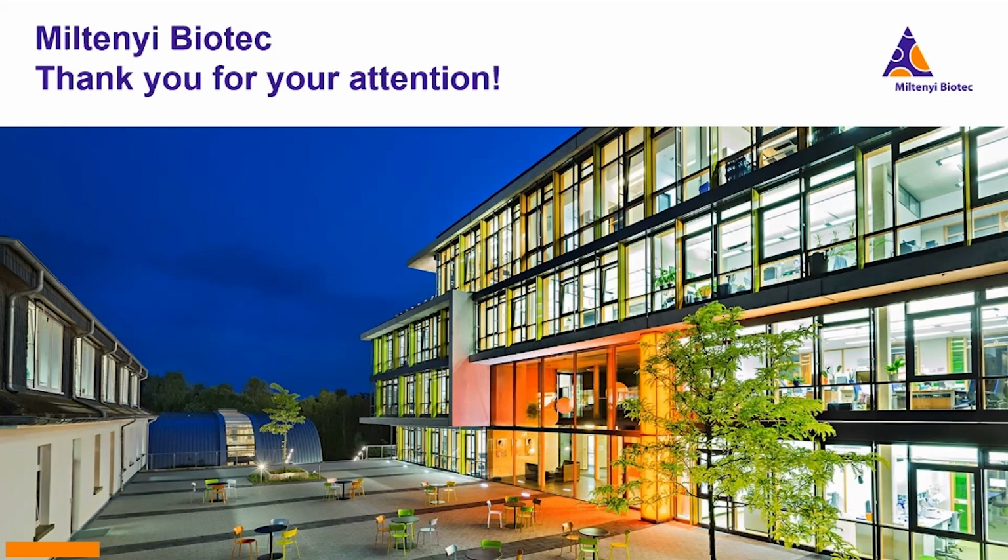If I might add something to this, which could be very interesting: the deparaffinization is done as usual, and the most common method is to use xylene. But I've heard from a couple of customers that xylene is pretty difficult to use in some labs. They asked us whether it's possible with a xylene alternative. Benjamin, maybe you have something to add with regard to this.